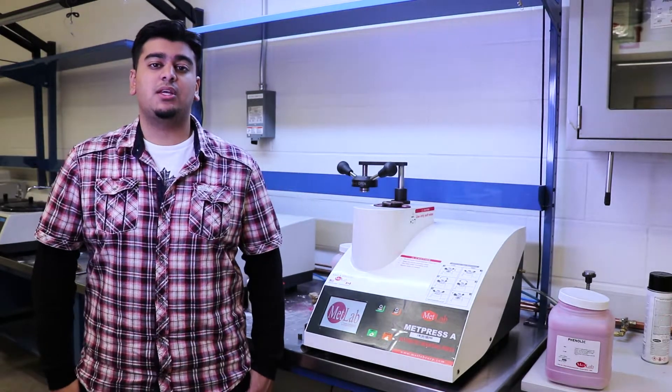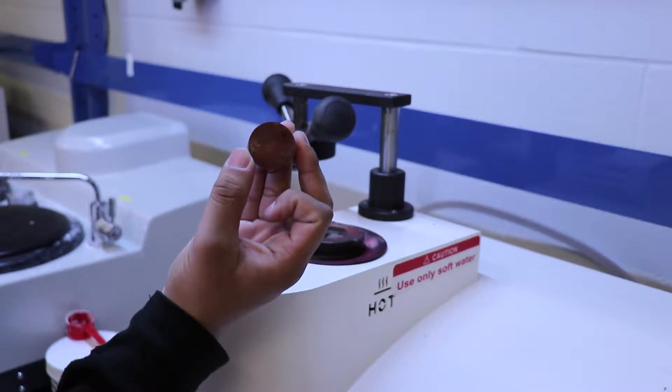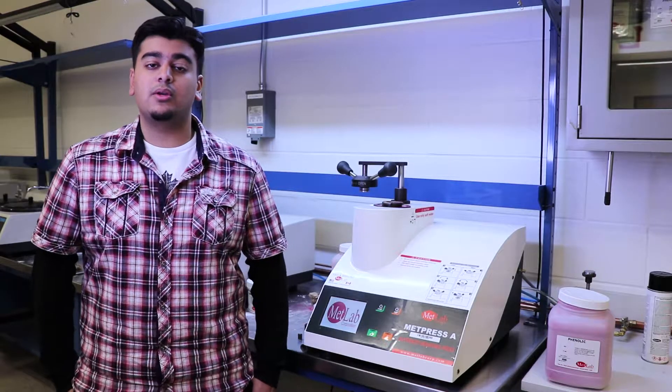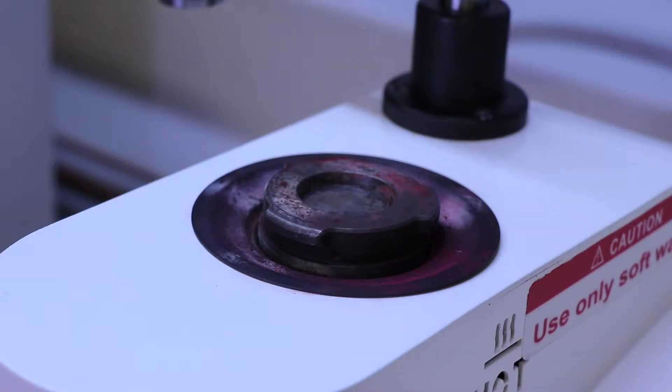So the purpose of this hot press machine is to create a puck-like block that's going to hold your sample so that you can do hardness tests or view it under a microscope. So the first step is placing your sample onto the plate of the hot press machine.